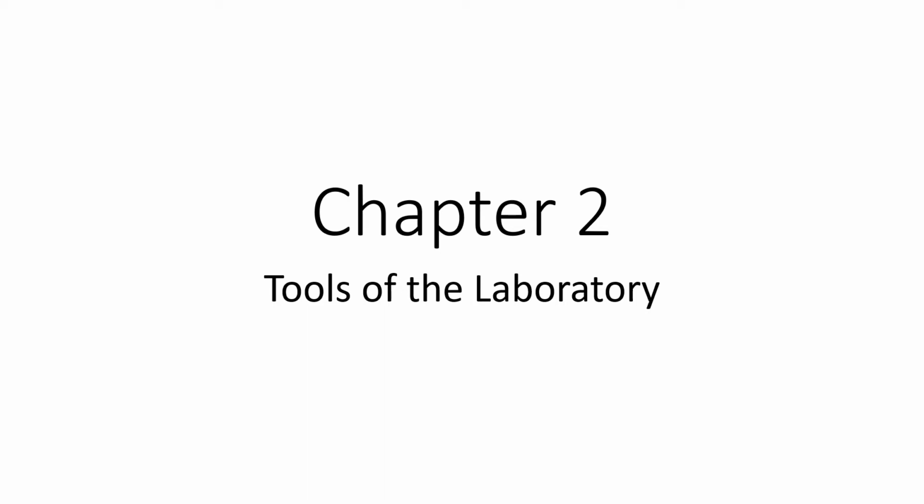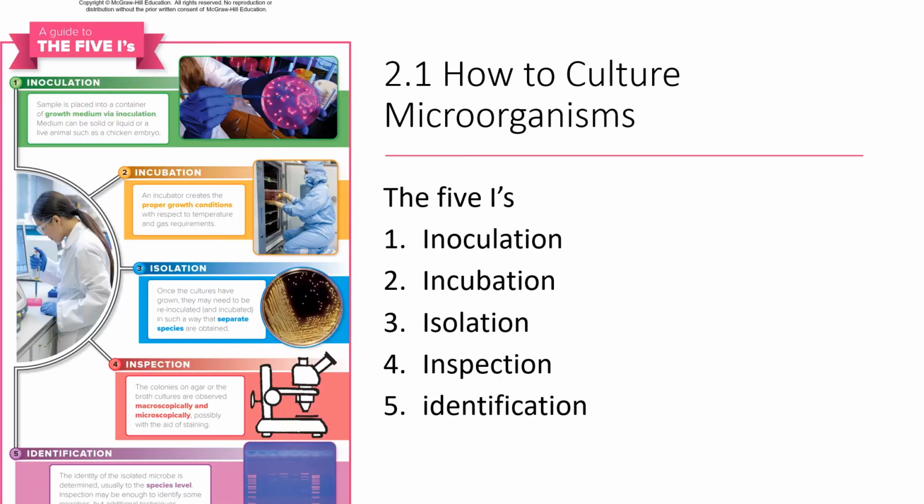Okay, for chapter 2, tools of the laboratory, we're going to be looking at what it takes to study microbes, specifically in a laboratory setting.